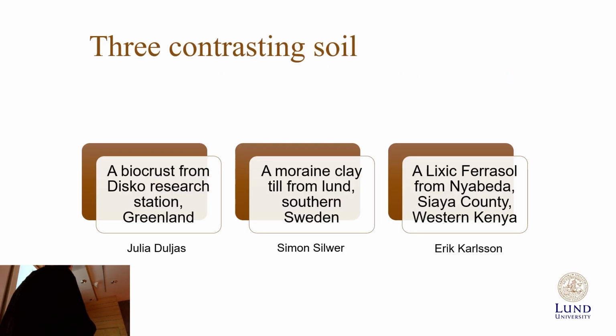To test it, we got soil samples from across the world, from Greenland, Sweden, and Kenya. It's worth noting that in Kenya, we took our chips and buried them under the soil. After a few months, we dug them up and used a portable microscope to look at the images. The samples from Greenland and Sweden we brought to the lab here, where we have a better microscope, which means we have very contrasting image qualities between those samples.